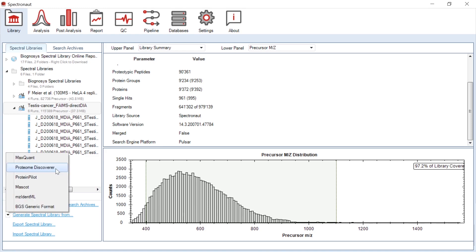Like for the other ion mobility technologies, analysis of FAIMS DIA data is possible as well by direct DIA approach, which means no library has to be generated. Spectronaut will deal automatically with multi-CV data on both library generation level and extraction of DIA data level.